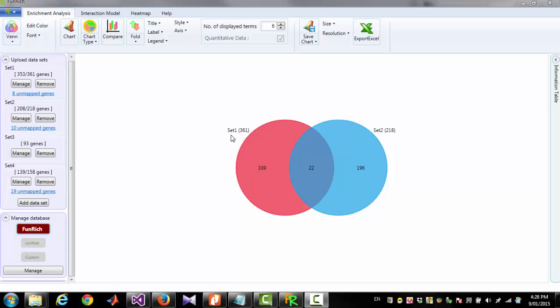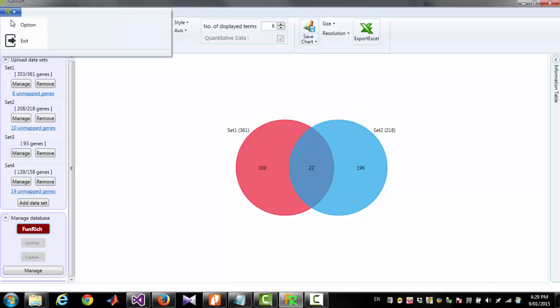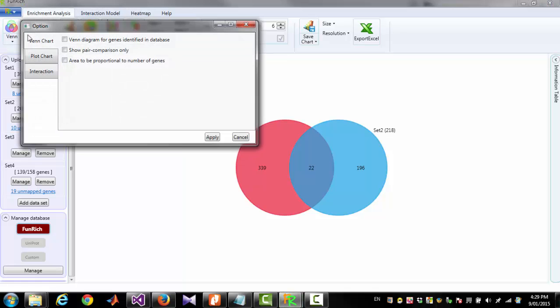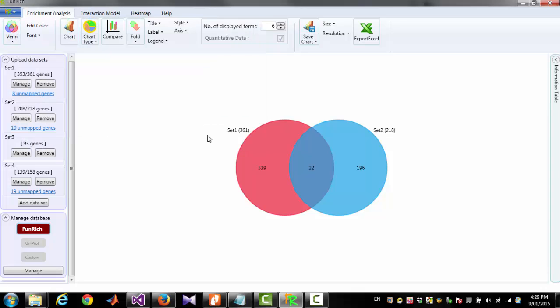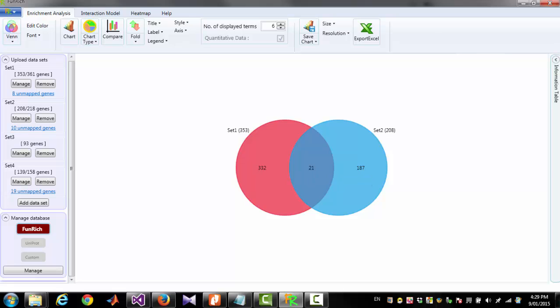Now according to this diagram Set1 has 361 genes. Of course 8 of them are not mapped. If you want the diagram to show only number of mapped genes you have to go to Option, Venn Diagram for genes identified in database. Now it will show 353 genes for Set1 and 21 common.